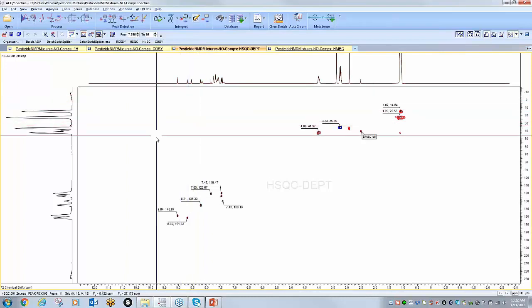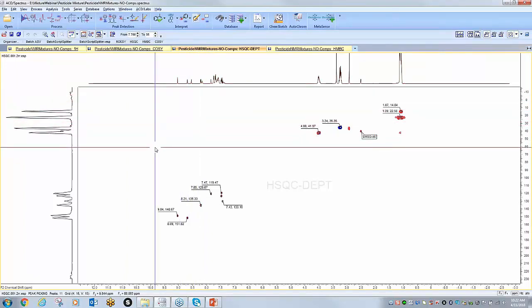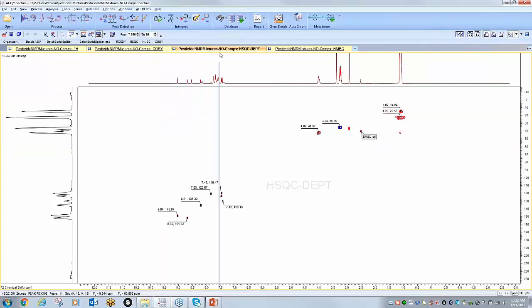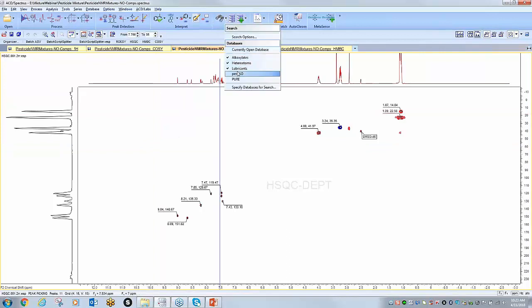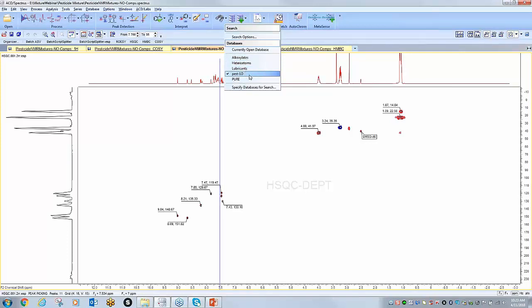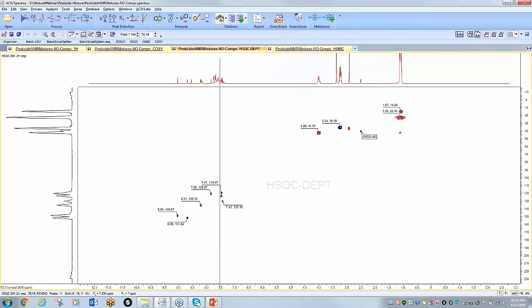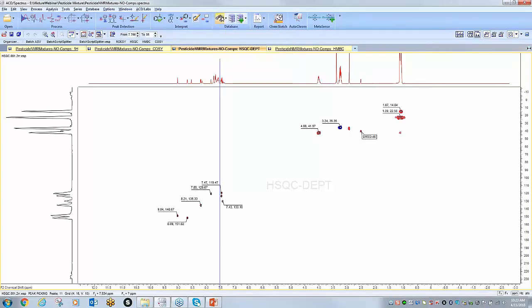And again I'm just going to ensure that I have the proper database selected. This database actually contains spectra of only 1D spectra, so I've got a proton and carbon. I'm going to query the database.